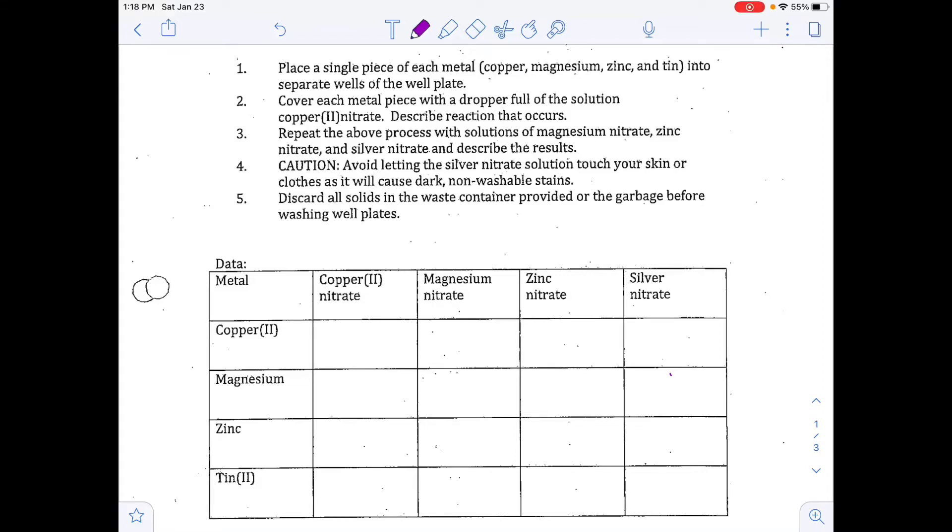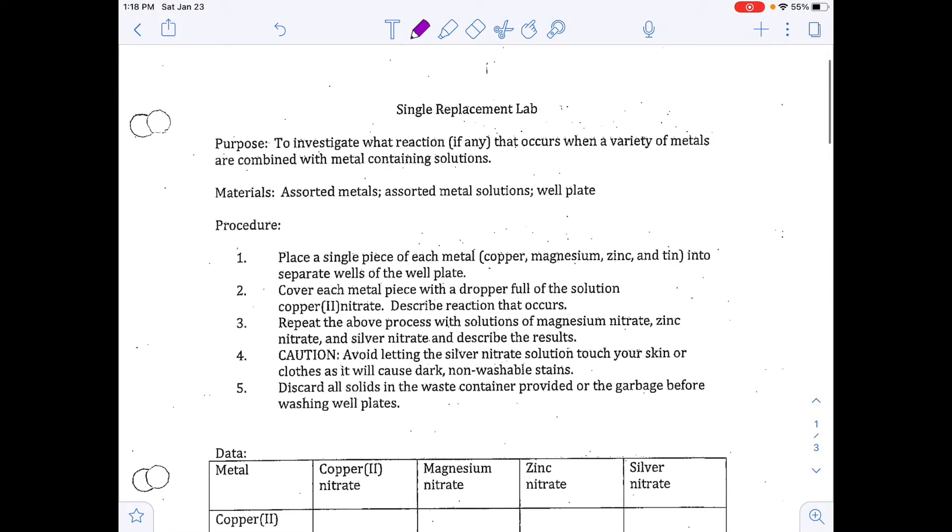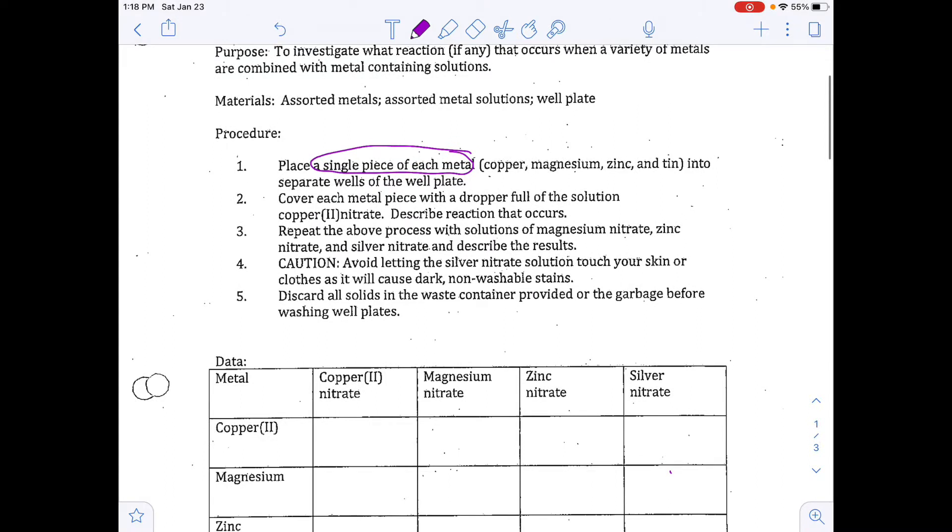We are going to do the single replacement reaction lab today. We're going to place a single piece of metal into each of the well plates and cover each metal piece with a dropper full of each solution.